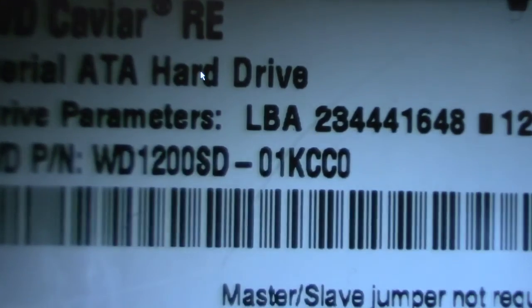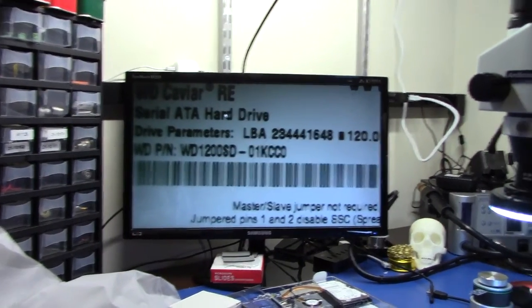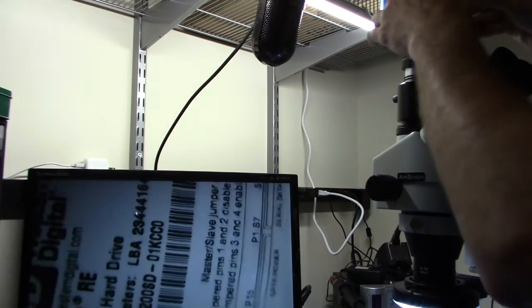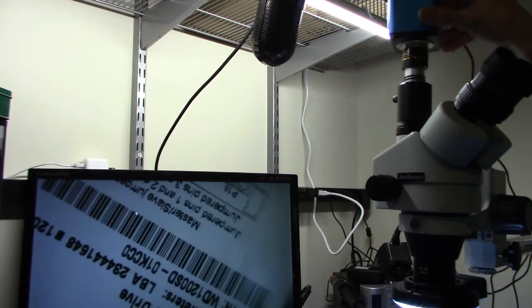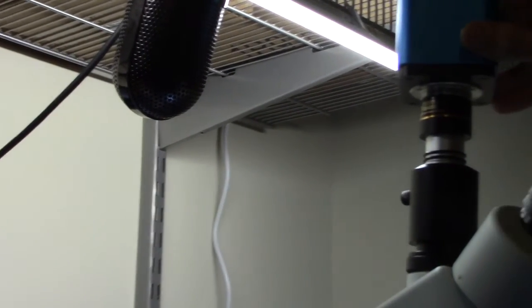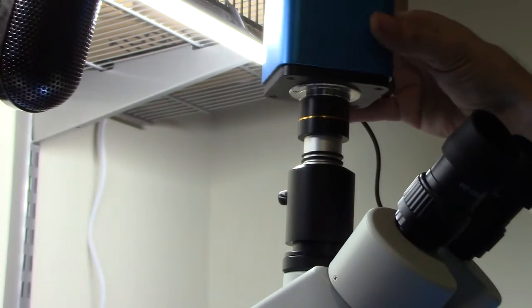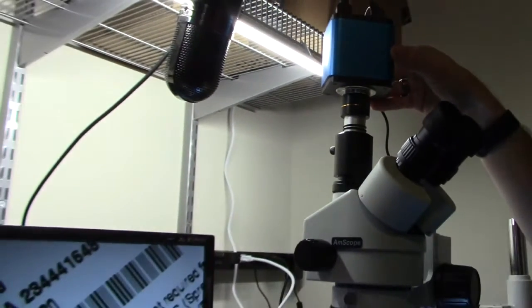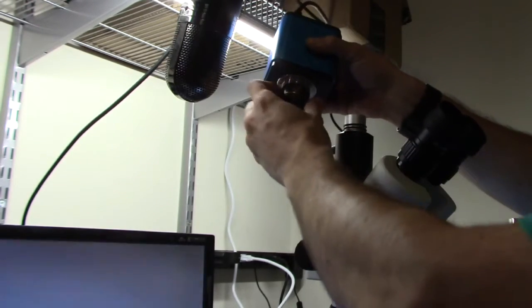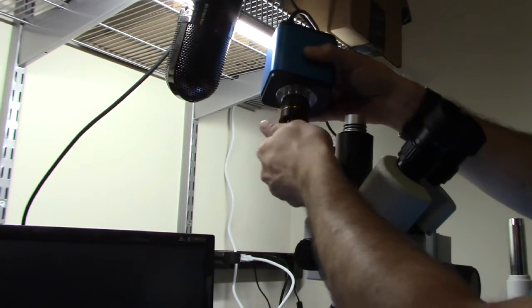Basically, what I have going on here — let me back up. I don't know if I can show this to you without really screwing up what I got. This is the new 1080p camera with the fixed FMA. I don't know if we're going to get that FMA in there. There we go — that's the FMA 050. So this is my old reduction lens. Nothing new here.